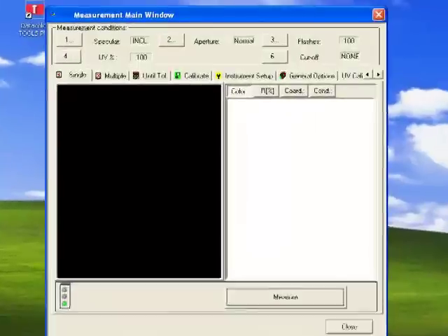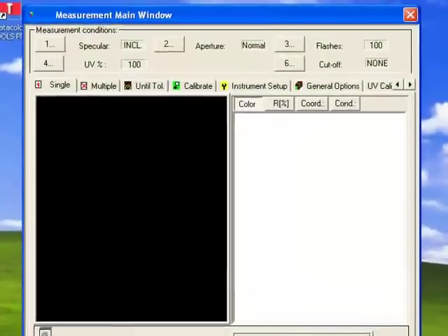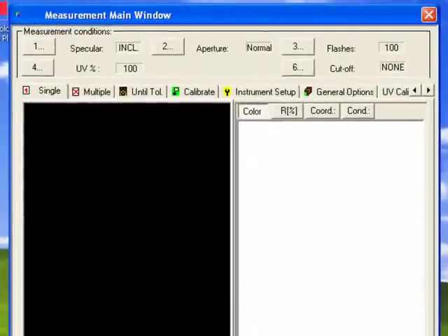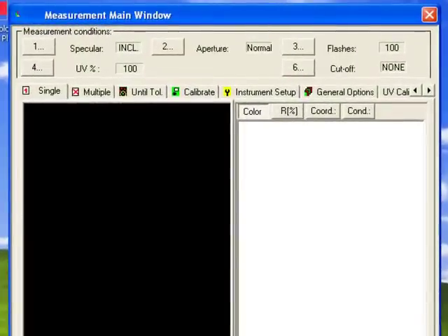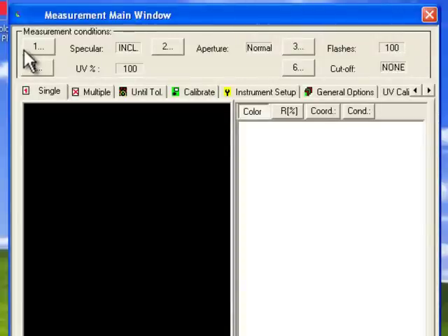Once calibration is complete, the system will return to the main measurement window. Notice there are options available to change the instrument settings.